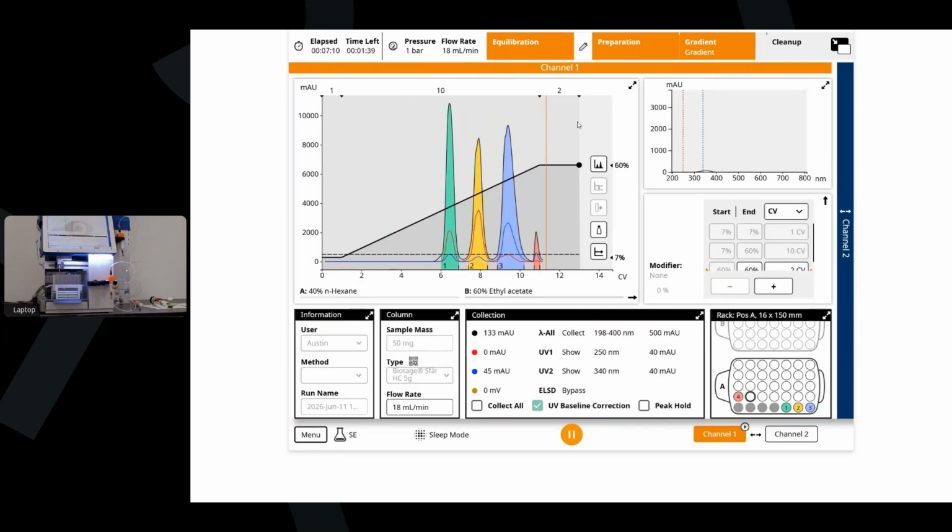And I think one thing that I like about this remote software is that I can look at my data from wherever I'm at. I only work about 15 to 20 meters or 20 yards away for those who live in North America from my computer or from the lab, but I don't like walking back and forth. And obviously, I'm not allowed to have coffee in the lab. So it allows me to look at data, and I can access this from wherever I am, especially if you've networked it and you have an active VPN. I can look at this data if I'm across the seas or over in the California area. So I can access this, especially when I'm working on projects, from wherever I am with the Selekt Remote software.